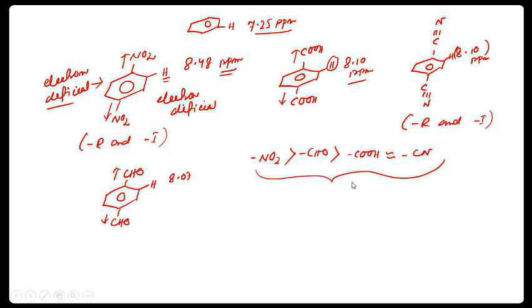So see, now you realize what fantastic phenomena are happening here. Whatever electronic phenomena you have read in books or been taught in class, there was no proof. Here you are getting the proof. Yes, it is happening. First of all, you got the proof that resonance happens, because of which two methyl peaks separated, that I showed earlier.